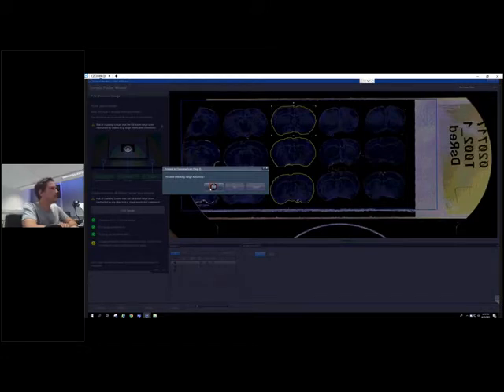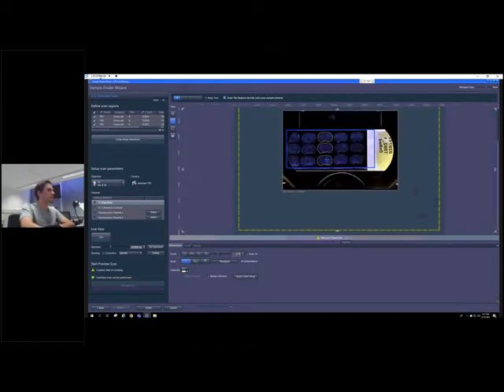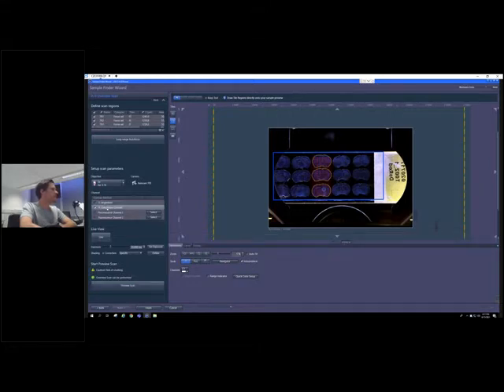And now we're executing three long-range autofocuses, always in the center of our section, running a focus approximation. And as you can see on the upper left side, we get the individual Z value for each and every one of the sections here, which allows us to directly go into our next step, which is to run a preview scan. And this is what I want to do in the next step.